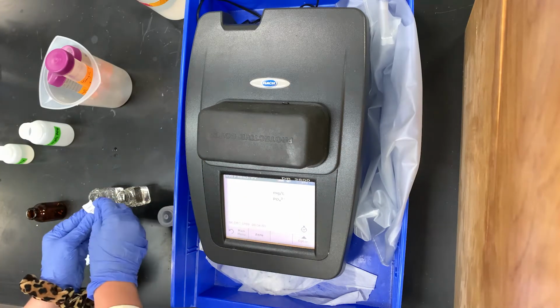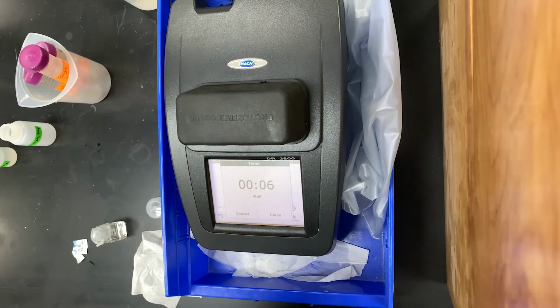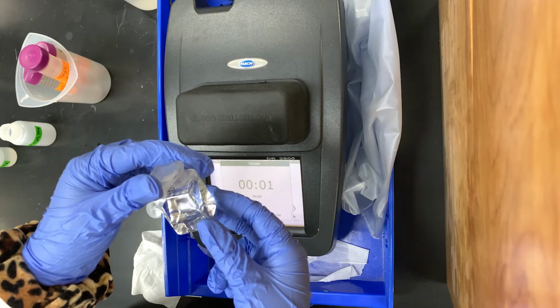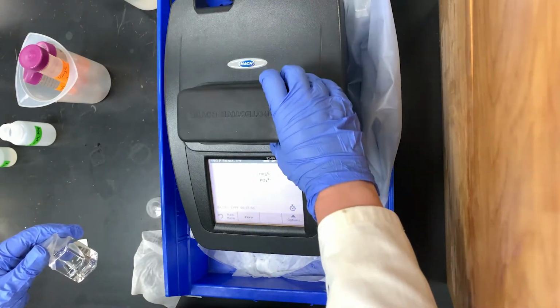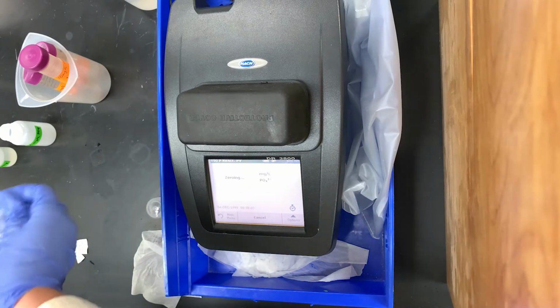And none of these have any dilutions needed, as they'll all fall within the 2.5 milligram per liter phosphate range. So I'm just adding the phosphate reagent, one of those powder pillows, into one of the cuvettes, giving it a good shake, and we'll be waiting the 2-minute reaction period. So now the 2-minute reaction is pretty much over, and again I'm just analyzing for the final concentration of the 1 milligram per liter standard.